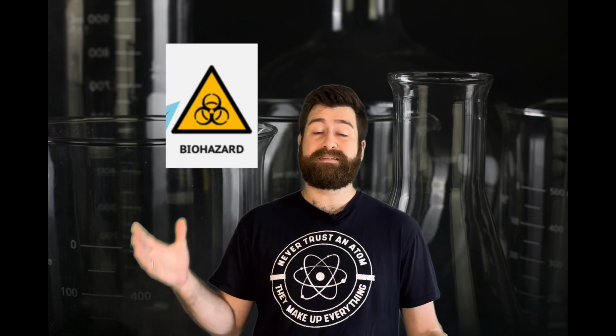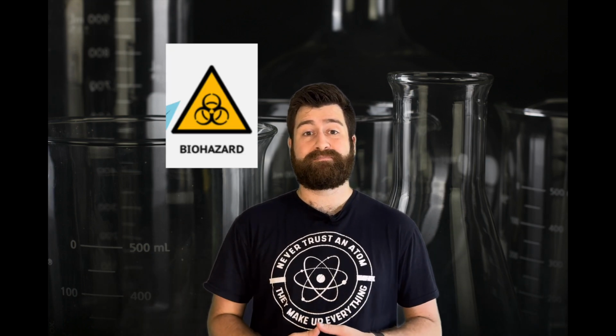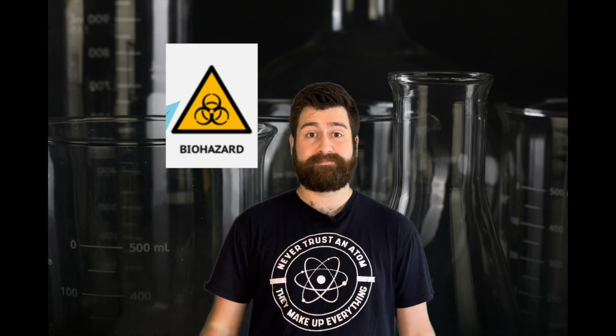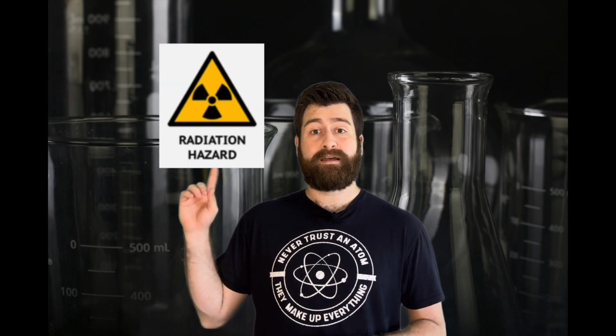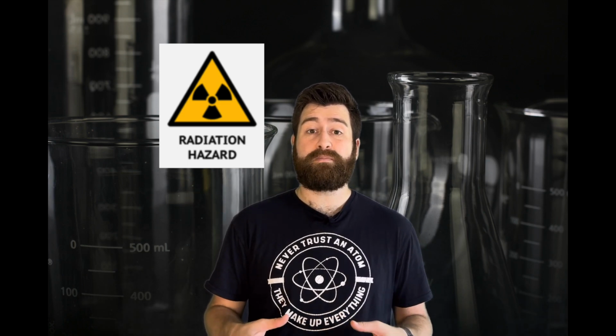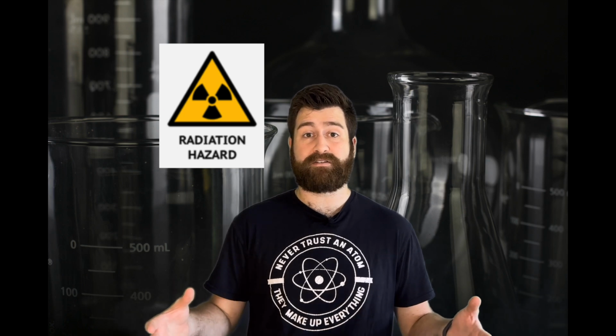This symbol means that the substance is a biohazard. Examples of biohazards include blood or other bodily fluids. This symbol means that there is a laser hazard and you should avoid contact with your skin or your eyes to avoid damaging them. This symbol means that there is the potential for radiation exposure and you should take all precautions surrounding that, like wearing a lead vest, for example.